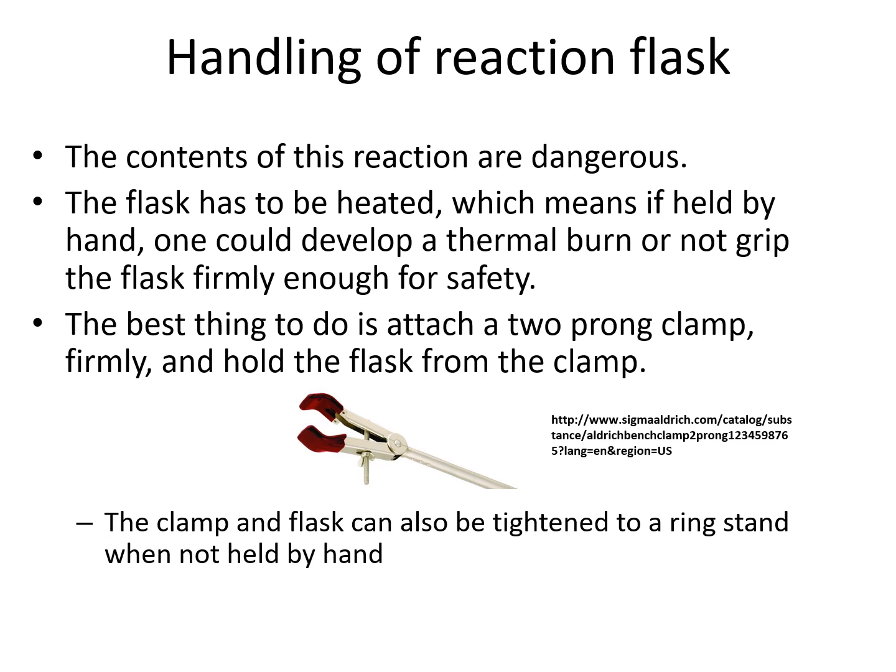Because we are heating our reaction here, most of the time, heat burns do not come from fire. Heat burns usually come from holding a glassware that's being heated. Why? Because it doesn't show any smoke.